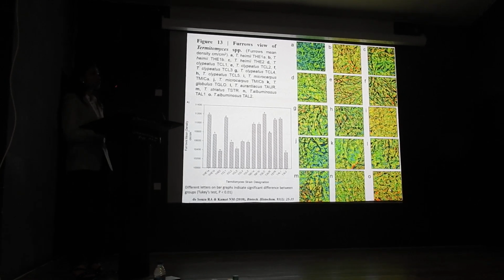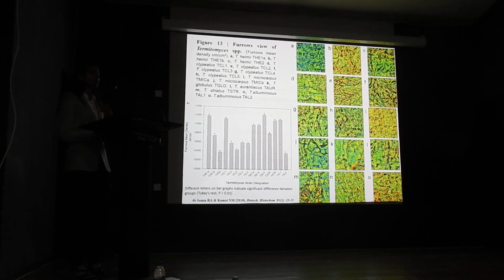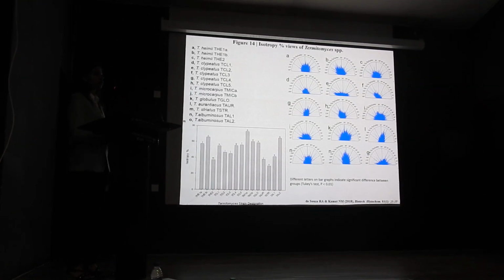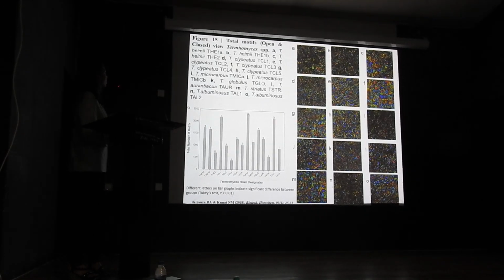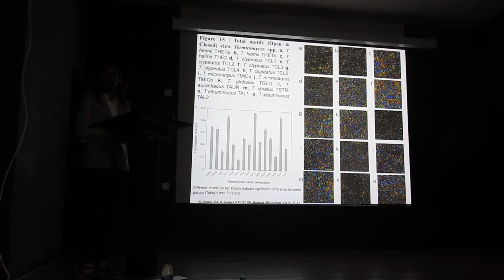So furrows actually indicate how much microporosity is in the pellets, so that will help in better diffusion and absorbance of the nutrients. Based on that, the classification was done. Isotropy indicated the uniformity of the pellet across, so that was also calculated, which was all done by using Mountains maps. And the total motif study was done, which gives the total surface area of the particular pellets.